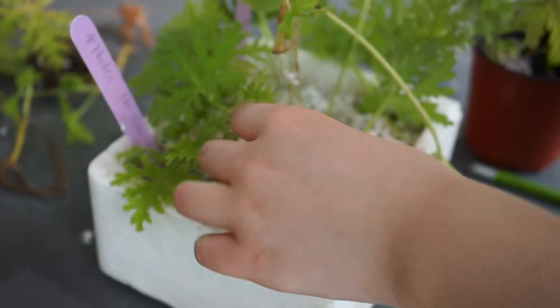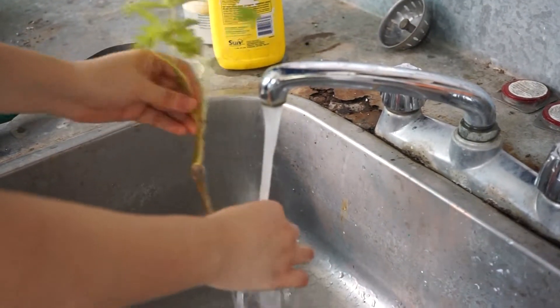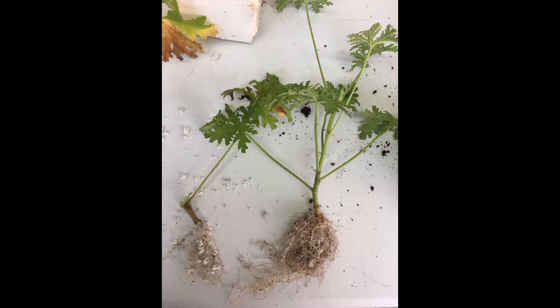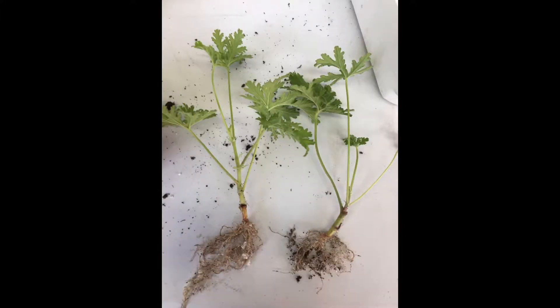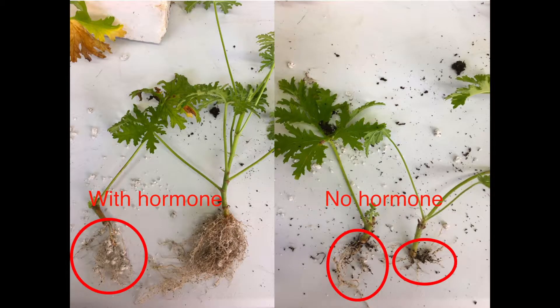Carefully dig out the Pelargonium cuttings from the perlite, then rinse them with water. Comparing 1-node and 4-node cuttings with hormone treatment, 4-node cuttings have a much larger root system. The root volume for 2-node cuttings is commonly in between that of 1-node and 4-node. 1-node cuttings without hormone show little rooting. Comparing 1-node with hormone and 1-node without hormone, hormone treatment can efficiently stimulate rooting.